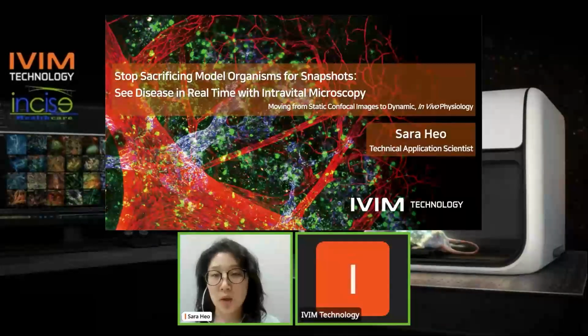In today's webinar, I will be introducing you to intravital microscopy, which you can utilize to reduce the number of animals via in vivo imaging and observe your model in real time.